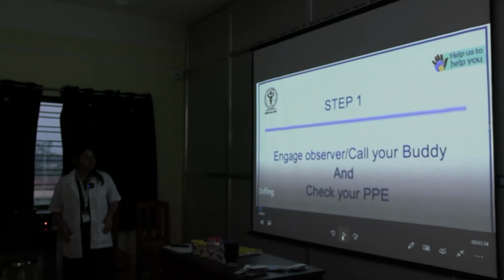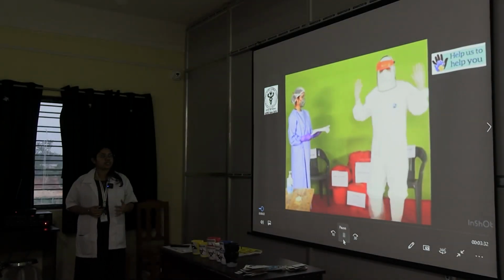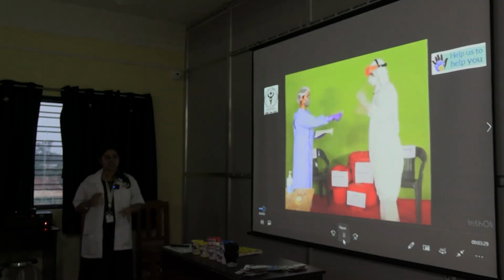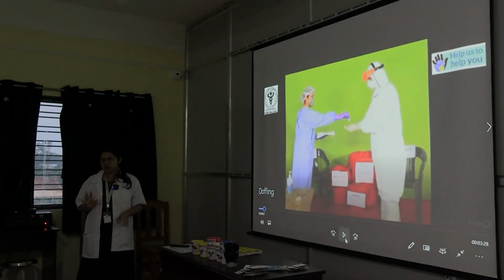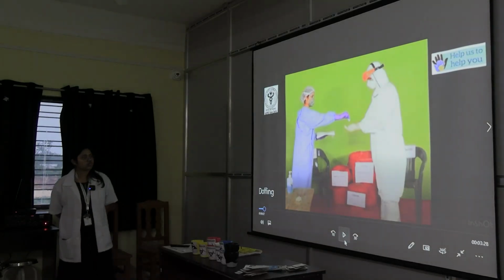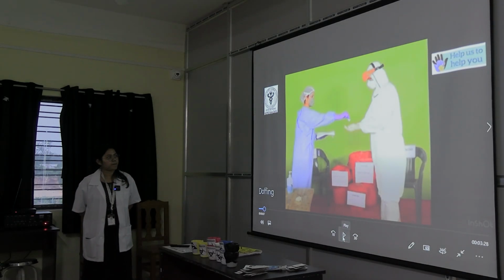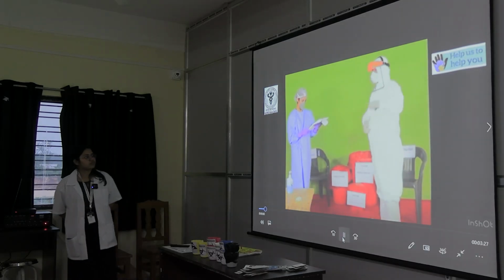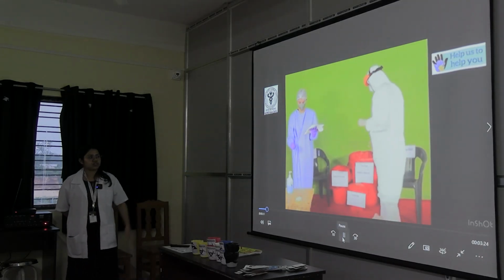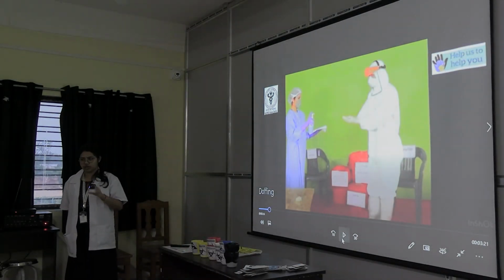So before Doffing, you should call any of your friends or any other nurse to observe and tell you whether there are any tears or whether your gown has become soiled with infectious agents like patient's blood or any other infectious fluid. And if it is soiled, then you can remove it with alcohol based wipes. See, he is showing that if any soiled things are there on the gown, you can remove them with alcohol wipes.